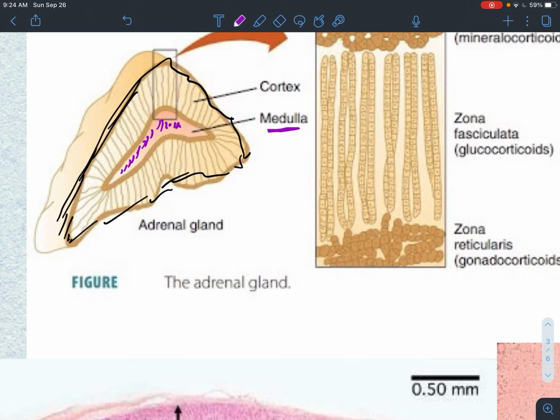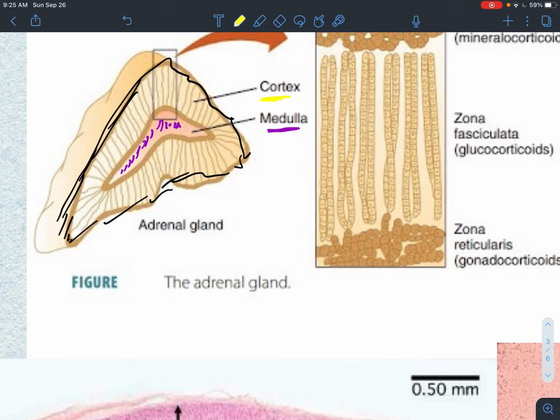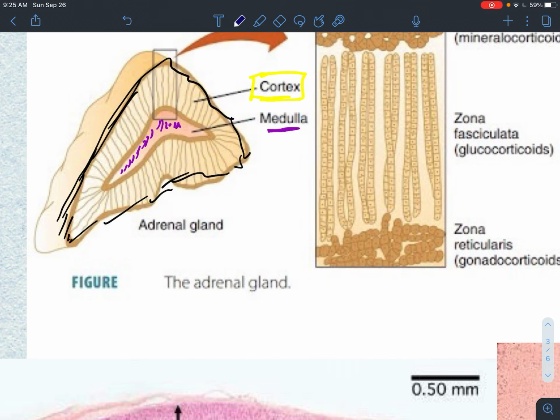And then for ANP2, our main focus of learning new material is on understanding how that cortex works. And the cortex is, of course, the part that is going to be on the outside and is encircling, right, the medulla. So all of that is the cortex on the outside.